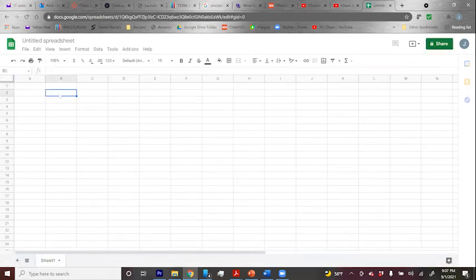All right, so I have water, and I've got 10% sucrose, and I've got 5. So volume, mils, and then up here, I've got grams, mass.